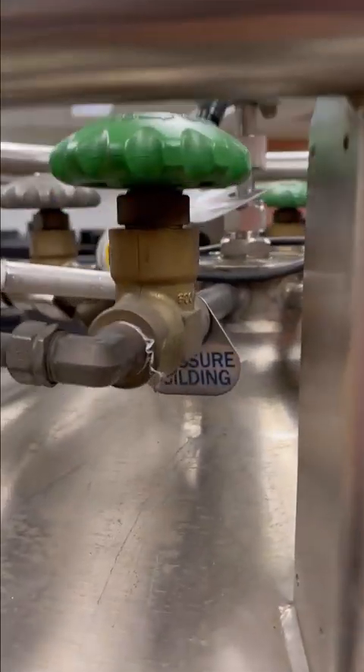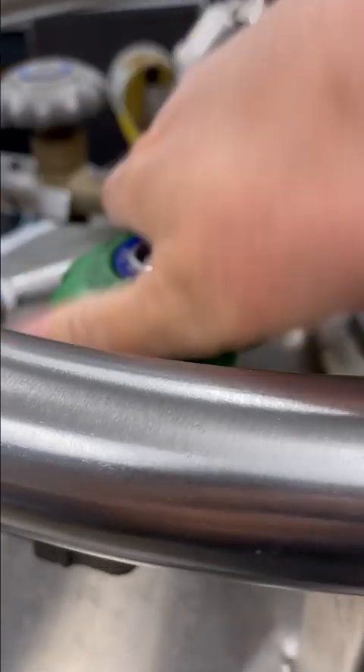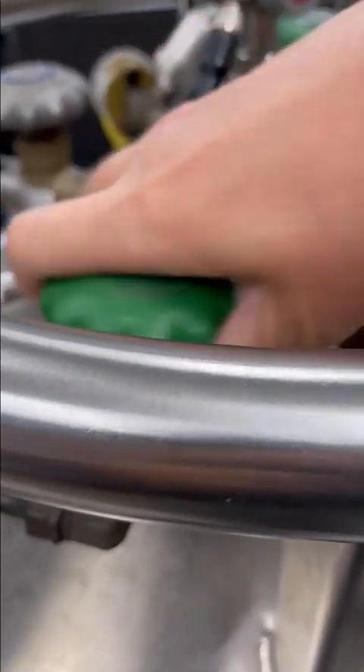The first thing is to build up the pressure. I'll just turn it on so that it will start building pressure for 15 minutes before I do the transfer.